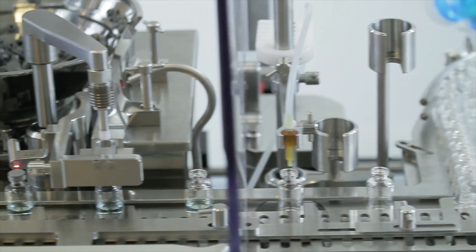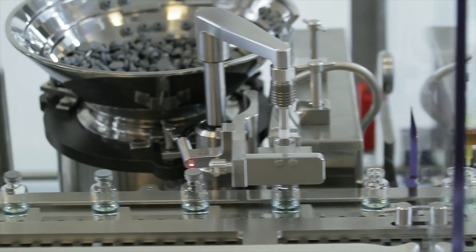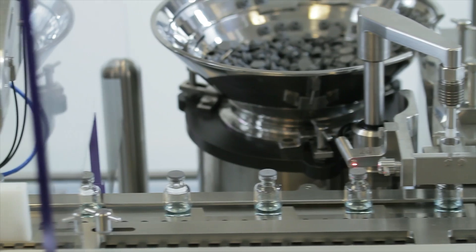Configuration options include guarding, automatic check weighing, integrated process control, and full batch reporting and traceability.